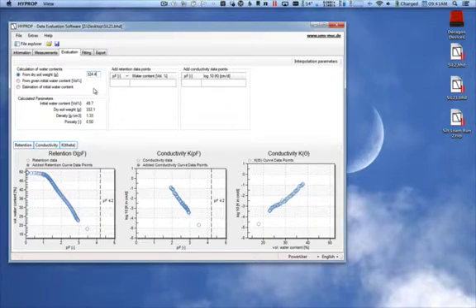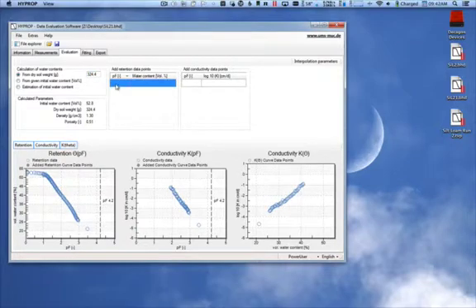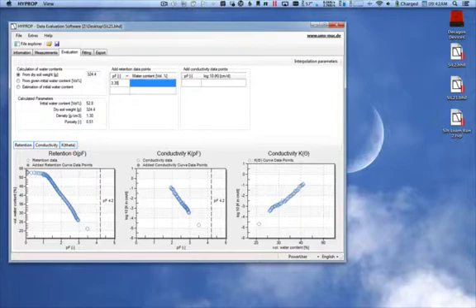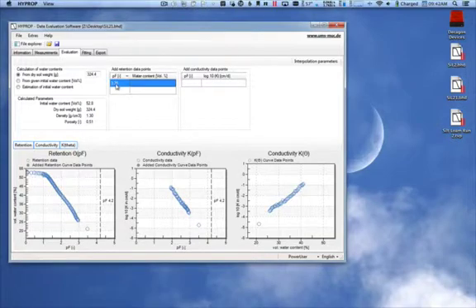Once we've entered our dry soil weight, we can also add additional data points from tools like the WP4C to extend our soil moisture release curve. The data must be added in units of PF and volumetric water content as a percentage.